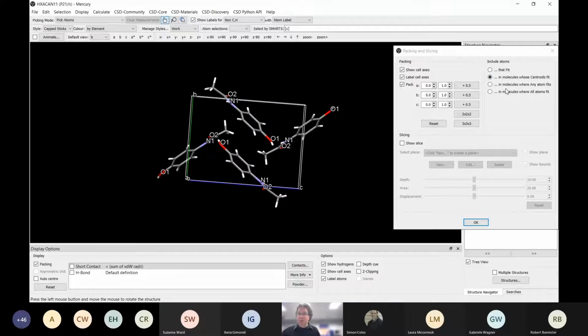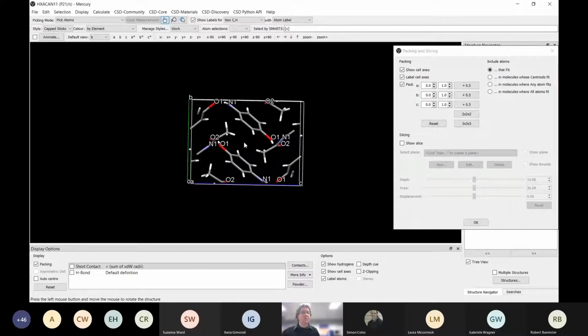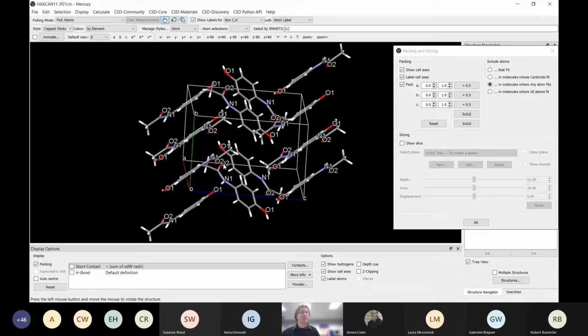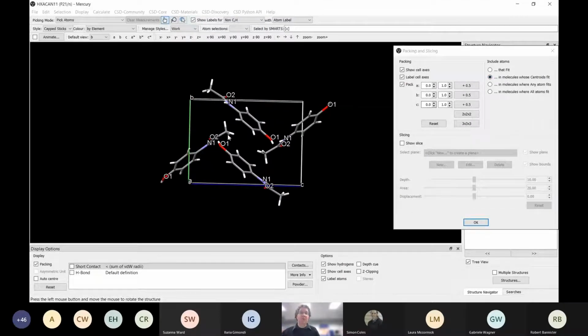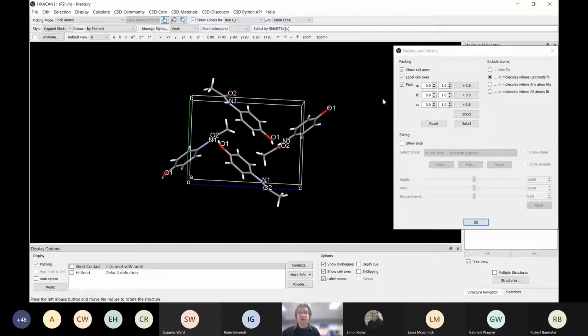So we have various options, and what we actually want to do is click the one that shows what the unit cell really looks like when you pack it, and you see we haven't got a full molecule. But if we connect up and do it for the centroids, we see where they are, and if we do that one, this is everything that has even one atom inside the unit cell. So we've got a whole load, but generally, as I say, you want to have the same number, so you have the Z prime correct and where the centroids are.